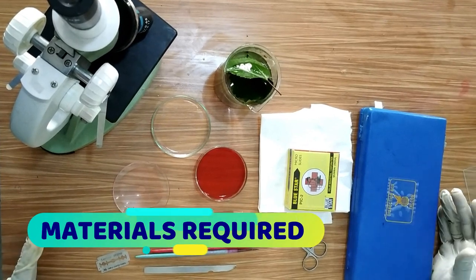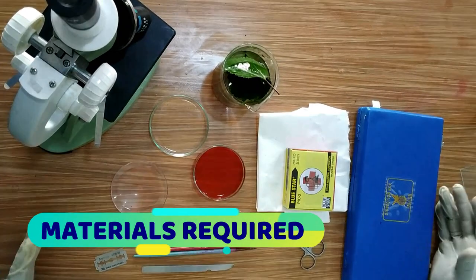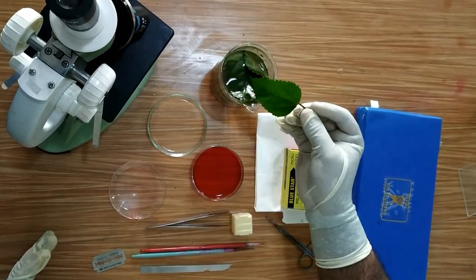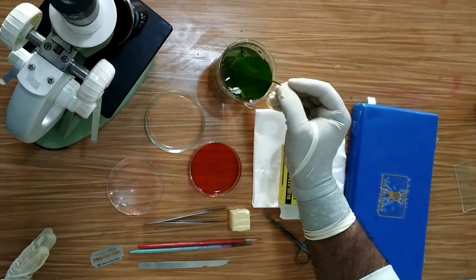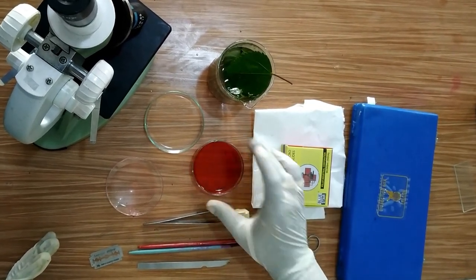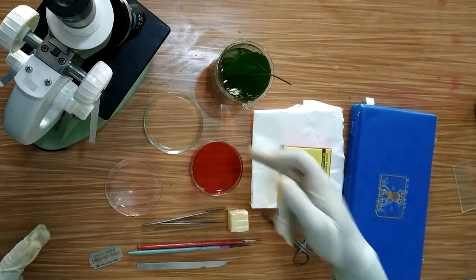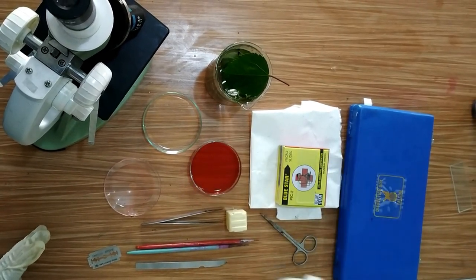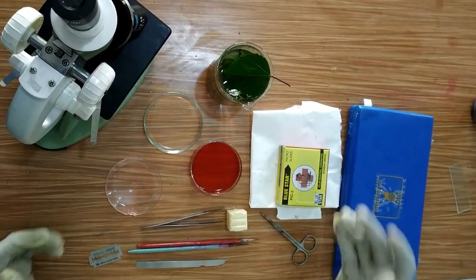To perform this experiment, we require a leaf from where we will collect the epidermal peel containing the stomata, safranin stain to give color to the stomata, water to wash, and glycerin to avoid drying and desiccation of the stomata.